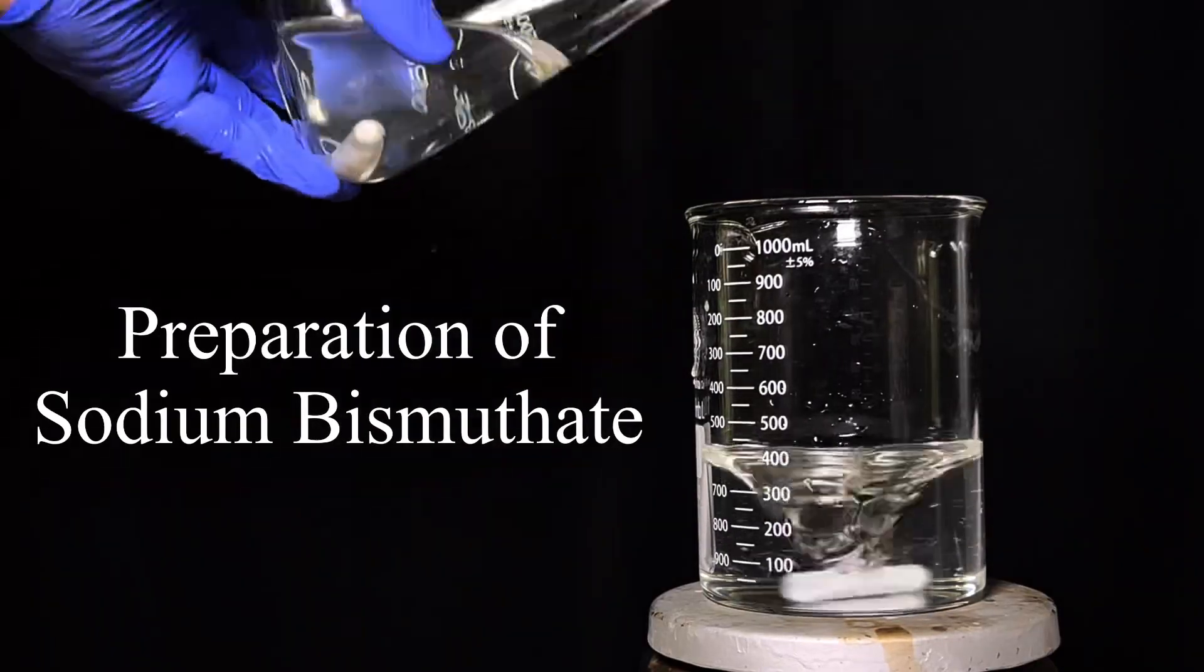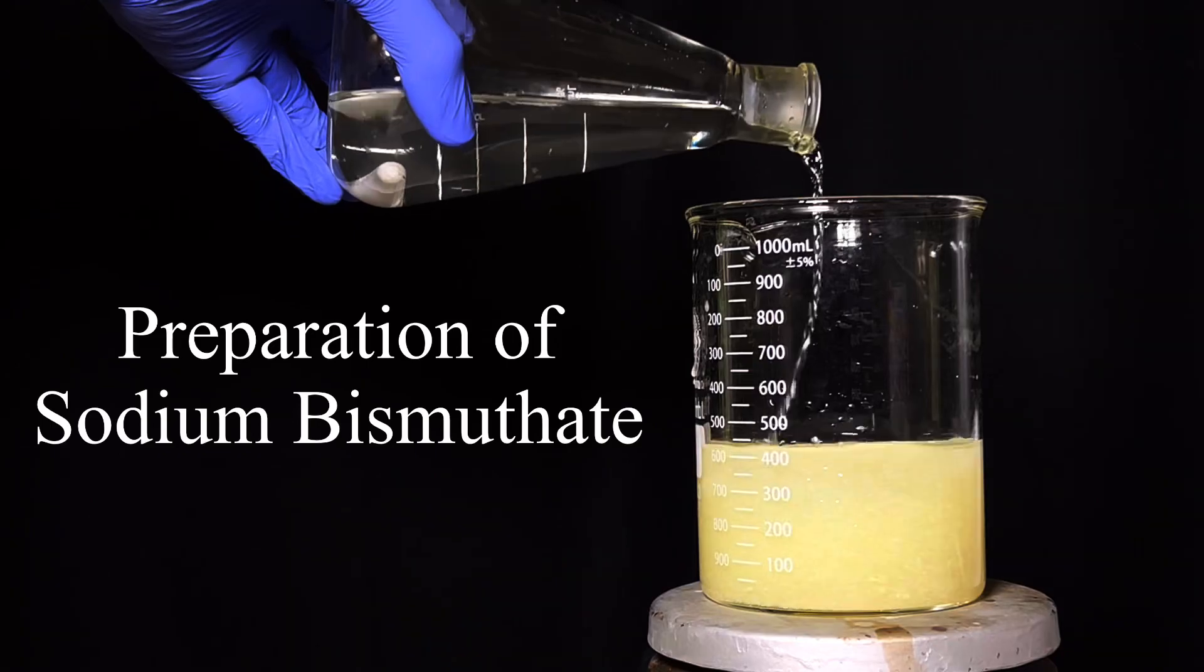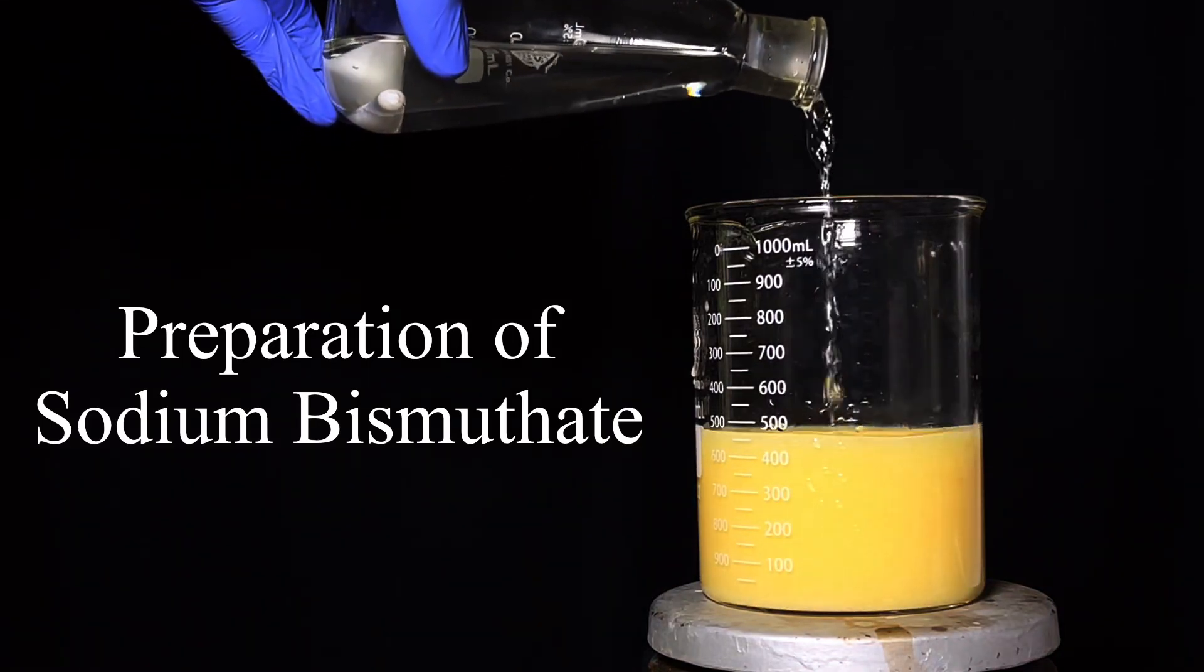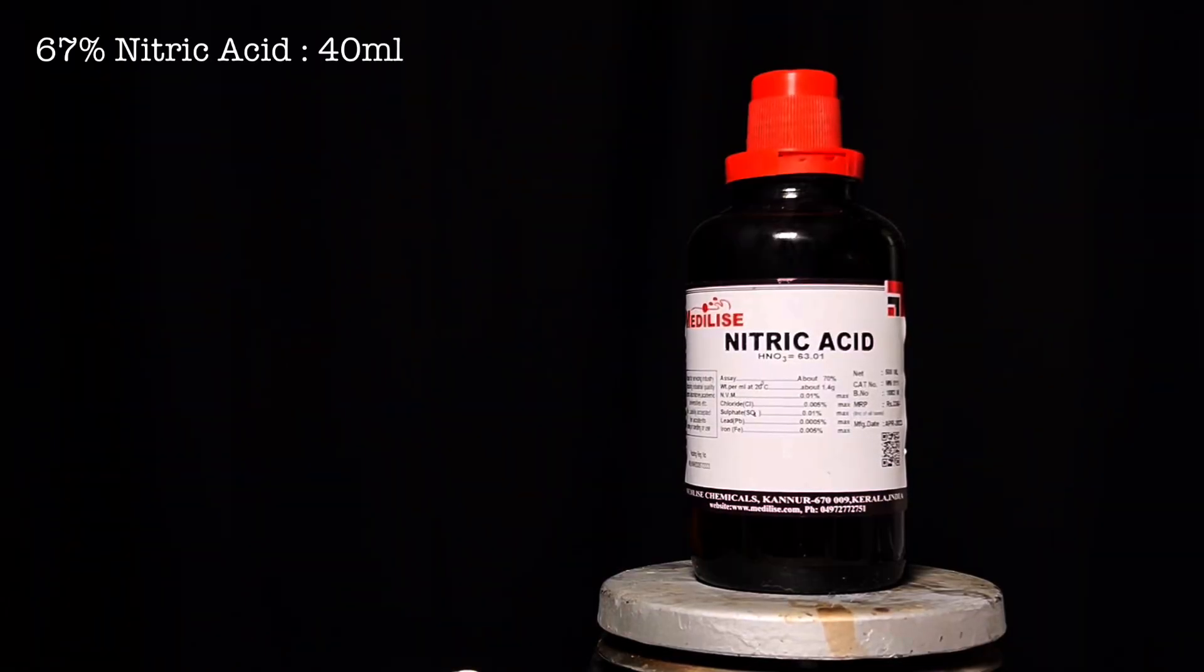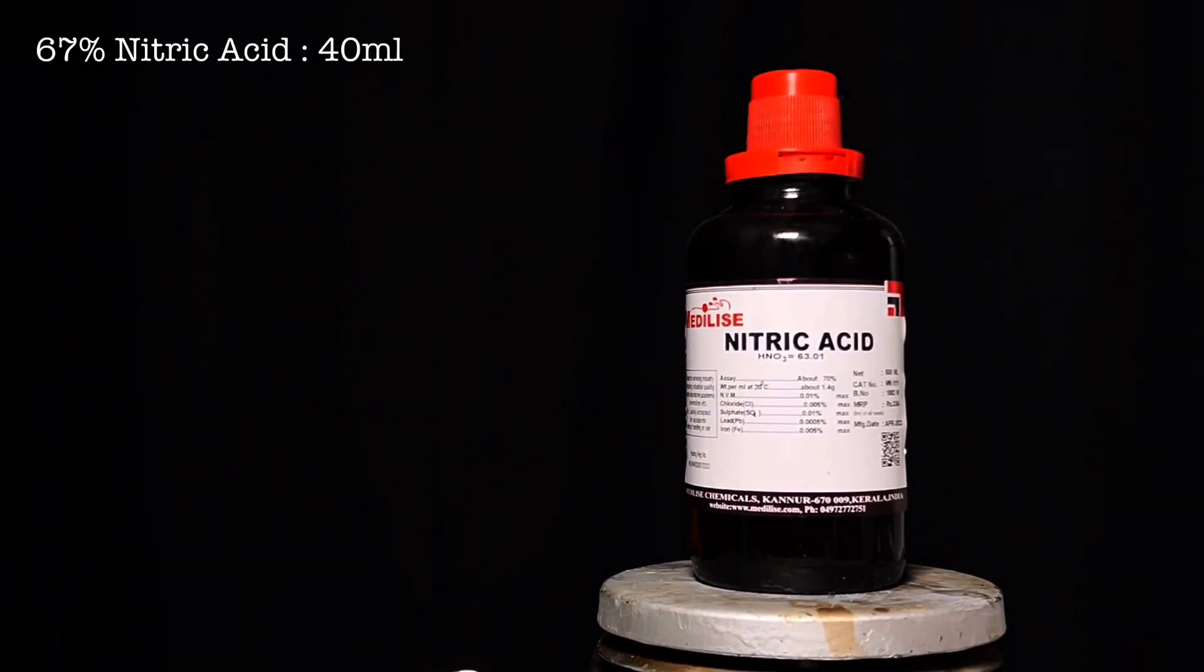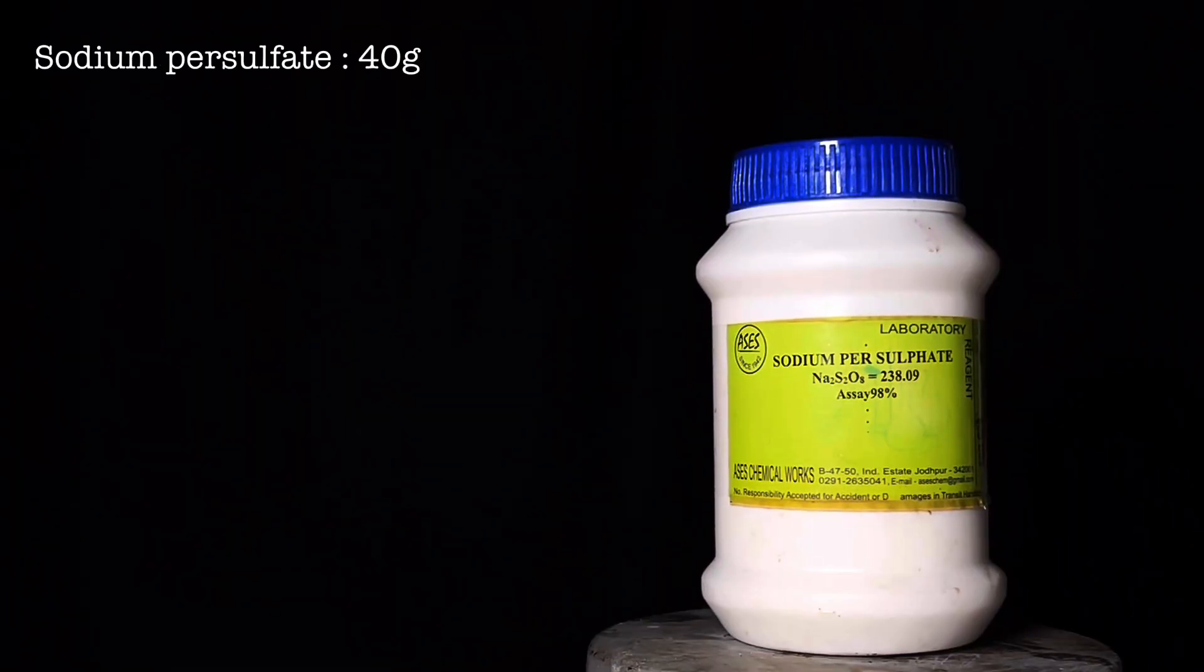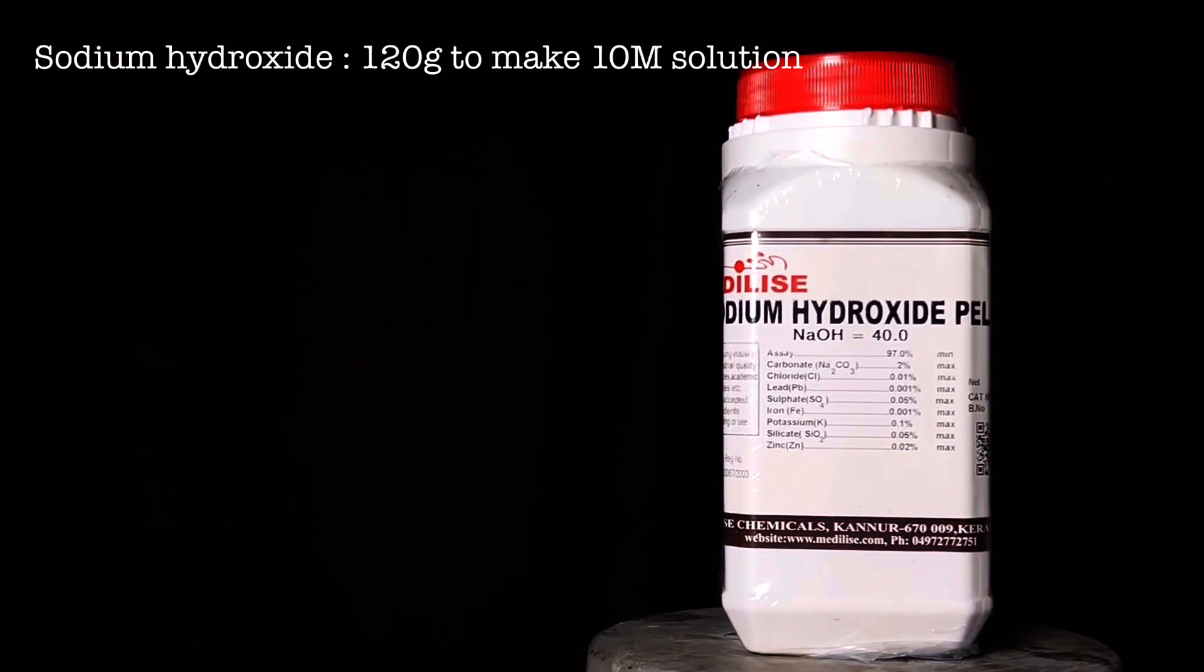Hello friends, in this video we will prepare sodium bismuthate starting from bismuth metal. For this preparation, we will need 17 grams of bismuth metal, 40 milliliters of 67% nitric acid, 40 grams of sodium peroxydisulphate or sodium persulphate, and 120 grams of sodium hydroxide to make a 10 molar solution of it.